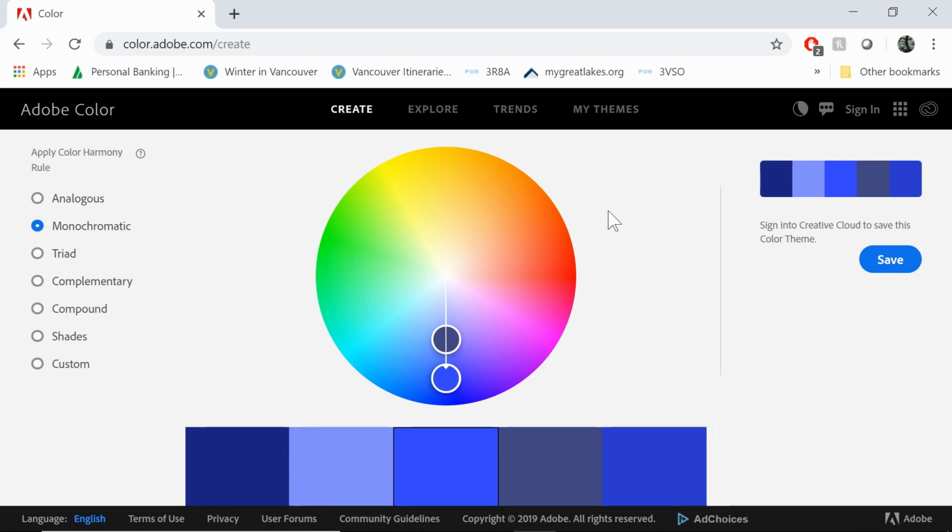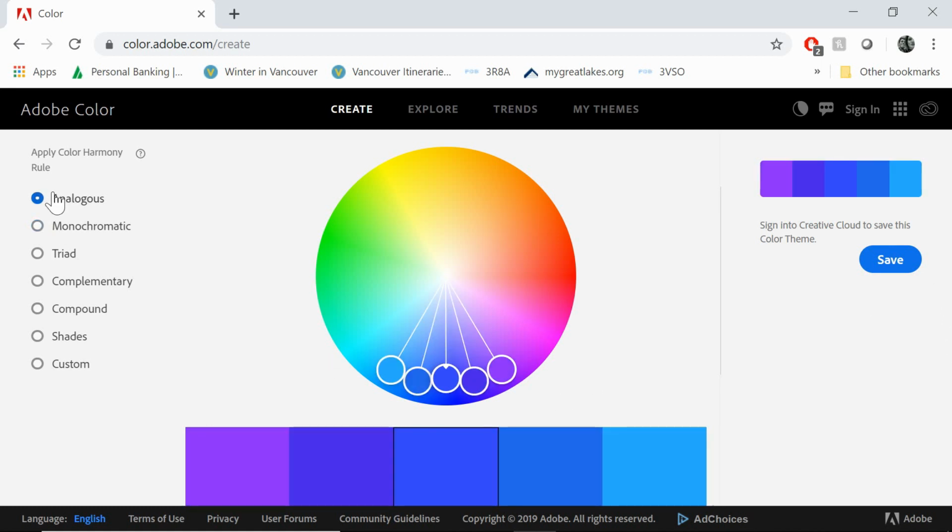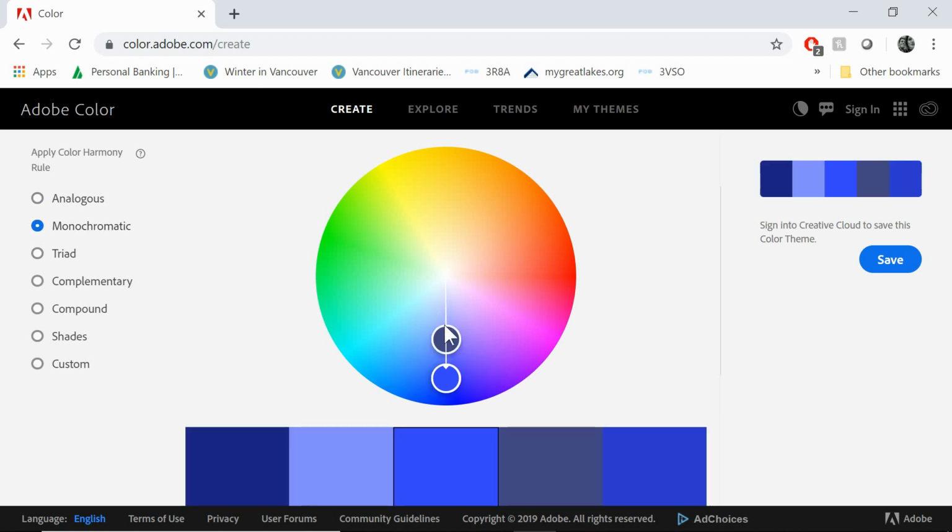Next is monochromatic. This palette type consists of different shades of the same color. This is useful when little to no contrast is needed, similar to analogous, such as highlighting key residue sticks protruding out of the receptor shown as cartoon. If you take a look at monochromatic versus analogous, they both have very little contrast. The difference is that analogous will choose different colors around the circumference of the color wheel, but monochromatic will only vary the brightness of the main color you choose.